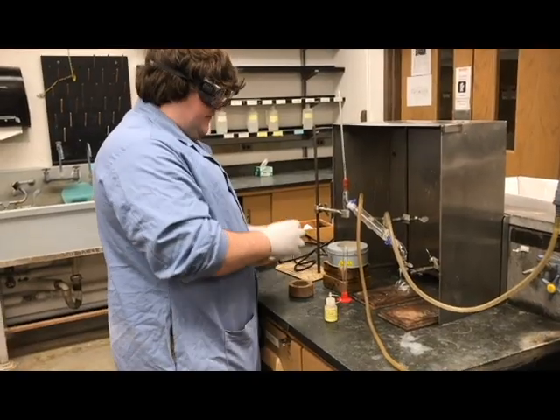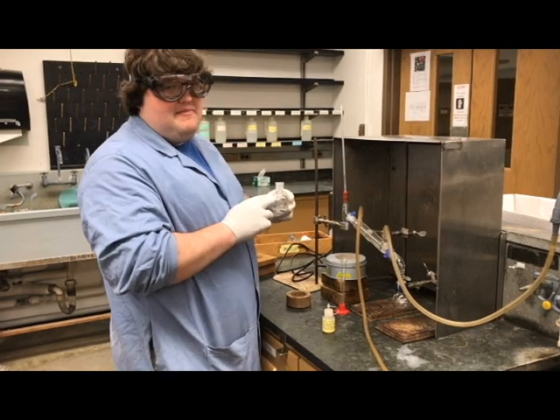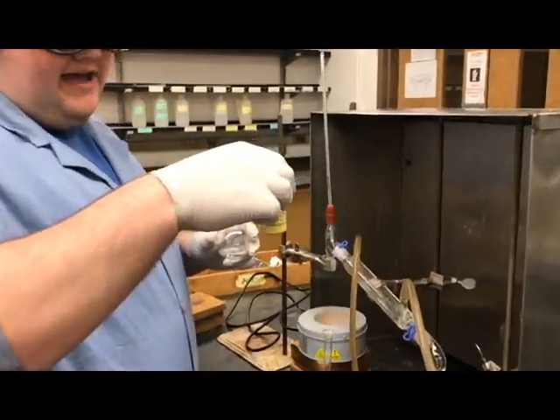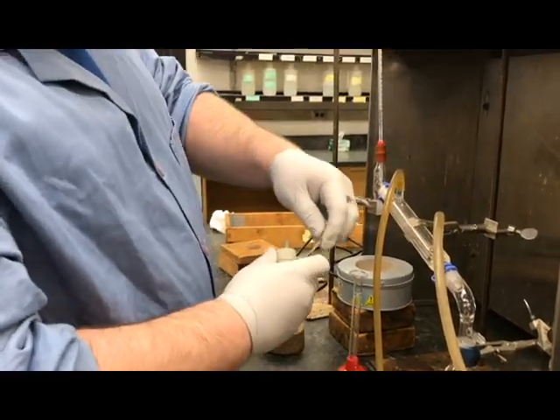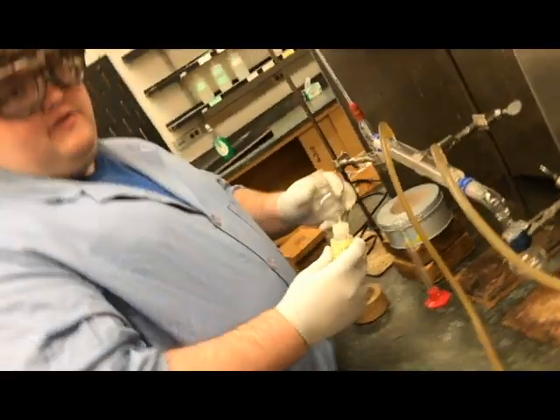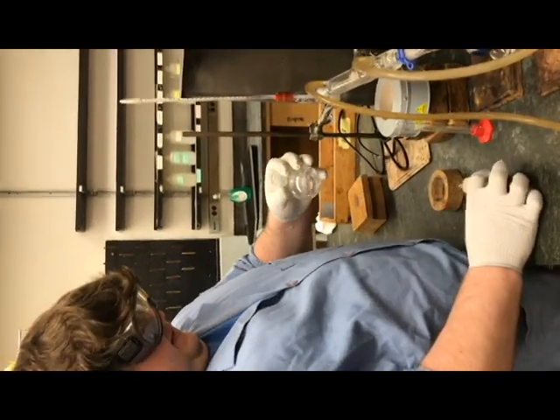Okay, so our first step is going to be adding our cyclohexanol to our round bottom flask. This is 10 milliliters worth. And next we're going to add this concentrated sulfuric acid. This is 18 molar. Now the procedure says to add 1 milliliter. We are going to add approximately 10 drops, which will be equivalent to 1 milliliter, slowly, drop-wise, while also swirling the container at the same time.